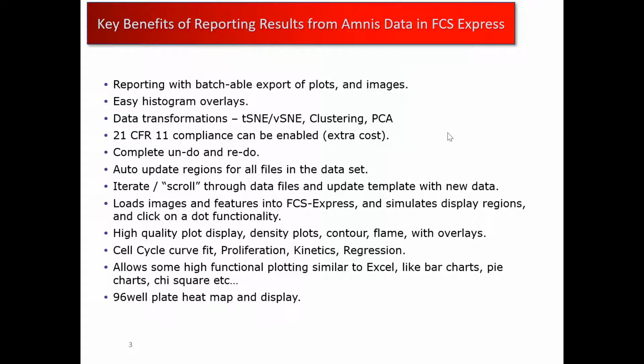The other important thing is, of course, FCS Express is going to load all of the images and features into FCS Express. So you have a lot of the functionality that you're working with in Ideas, and you're not just throwing away those images that you painstakingly acquired. Also, if you're working with cell cycle data, if you're working with 96 well plates, if you're going to be doing downstream analysis in things like Excel and Prism for regressions and IC50s, a lot of that can actually be done directly in the software. A lot of this you're going to see through some of the examples today.